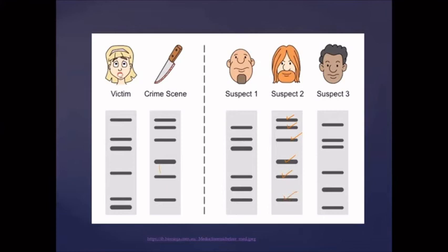Right, so generally in a question paper, you take a ruler and verify that each of these is in the correct position. So in this case, the scientist or the investigator would have proven that the sample found at the crime scene was from suspect number 2.